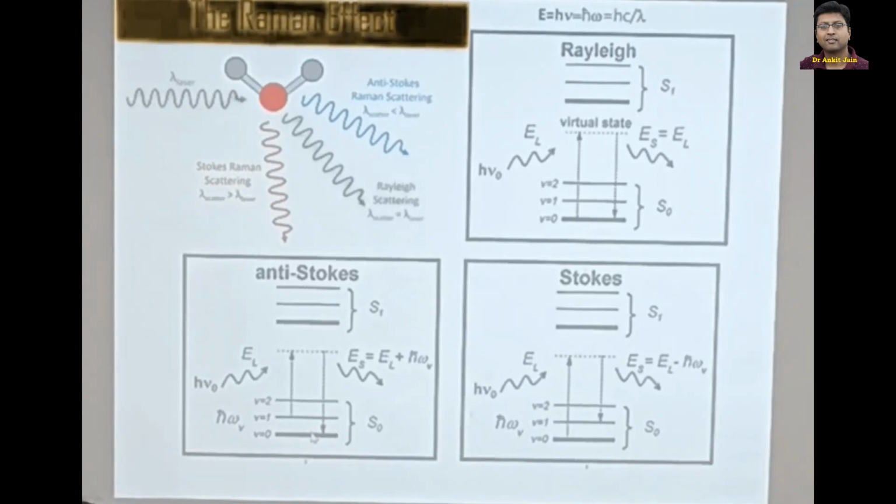So in Raman, if you have a detector which can detect the whole range, that is from positive to negative, with respect to our incoming wavelength, then we are able to see both Stokes and anti-Stokes. But as you know, this kind of anti-Stokes phenomenon seems very counterintuitive in terms of energy. When you hear that some energy is put in and more energy comes out, sometimes it feels like it is not real. So its intensities are much lower and much more difficult to detect than the Stokes intensities. It's quite normal from our perspective also.